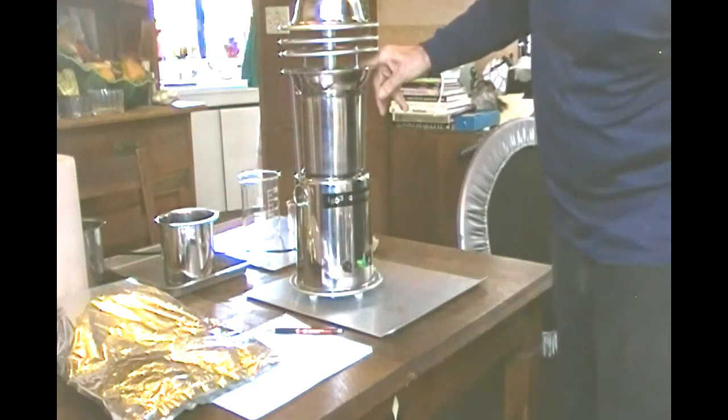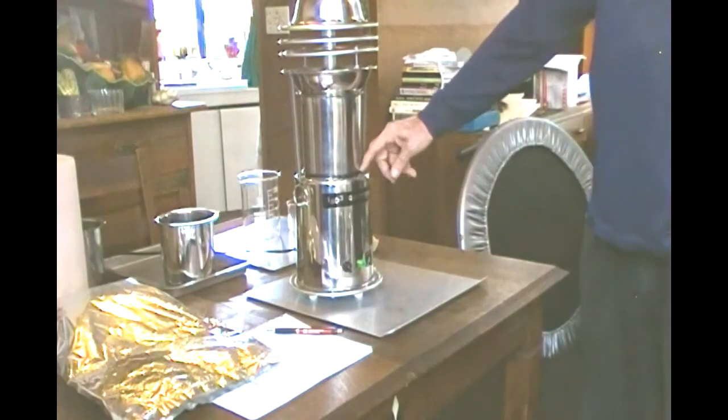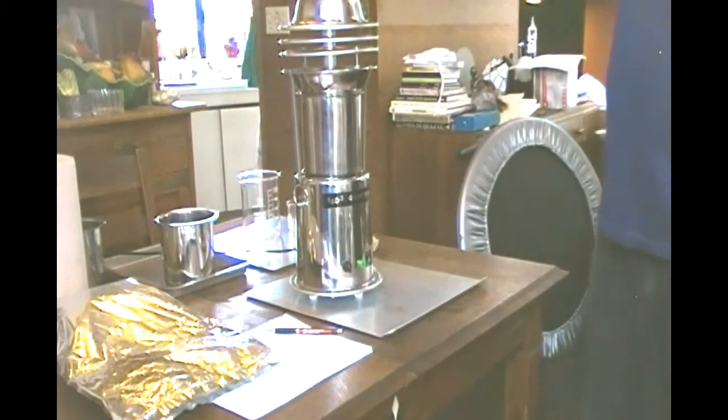And we're going to be putting tap water in the top. So if it would tip, the last thing you want to have happen is the water to wash into your extracted whole plant oil. So now we have the condenser attached.